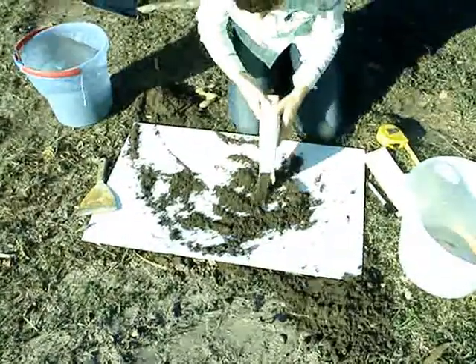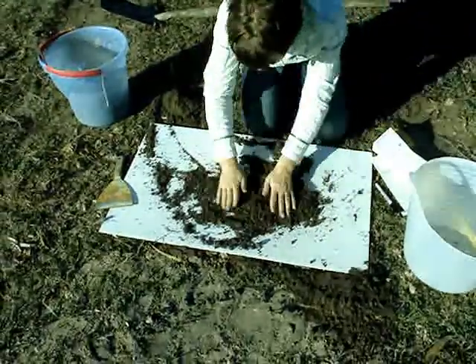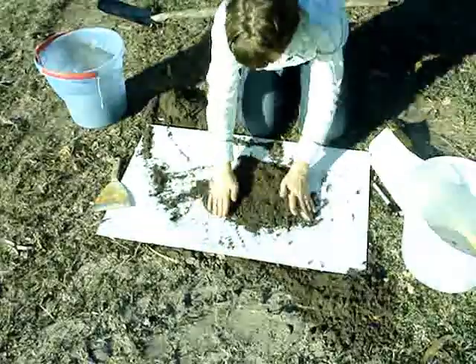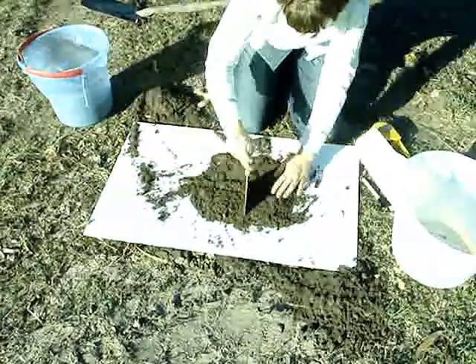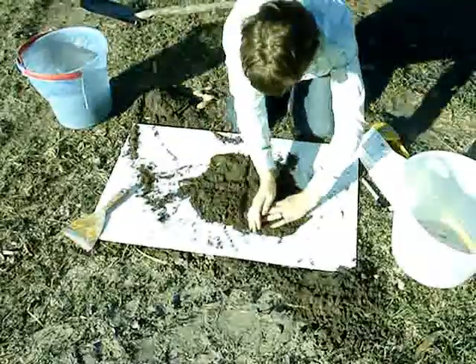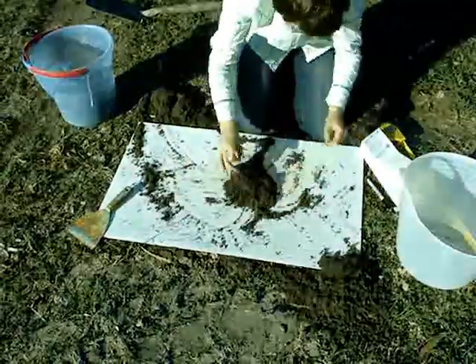We're actually going to have a little bit too much, so we'll quickly quarter it down again and then we'll be right to fill up the bag and get it ready to send off. That should be enough now.